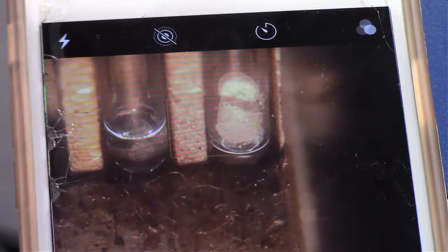Alright, there's still a few crystals in there. We're still at the high end of 230, 233, 234 now. Okay, still at 234, and now it looks like everything has melted on the left. So at 234, everything has melted.